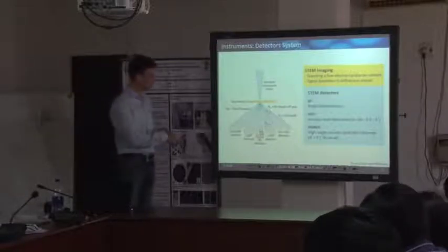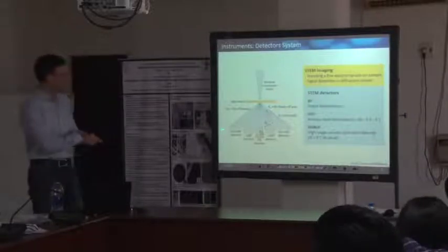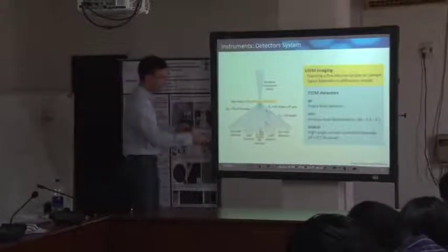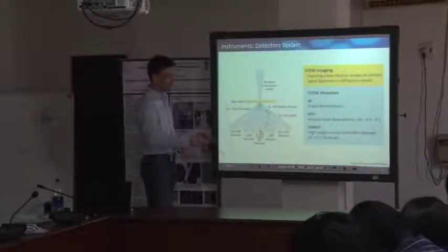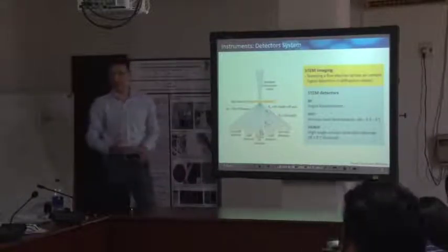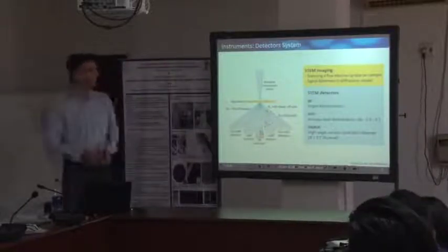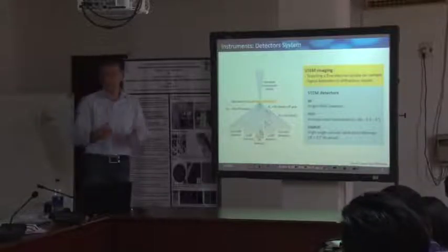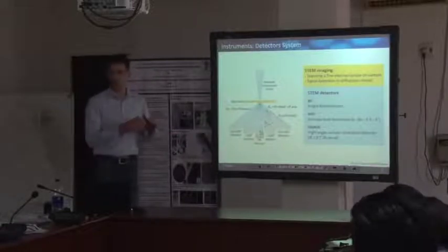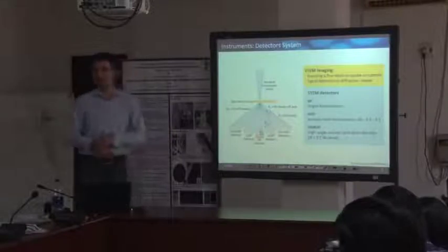Most microscopes come with a so-called HAADF detector, which means high angle. This is written here, high angle. This is large scattering angles. High angle annular dark field. Annular means it's a round detector. Dark field because it's not the direct beam in the center that we collect, but we collect signals which are scattered into a very large angular range. And this is what commonly provides chemical contrast.